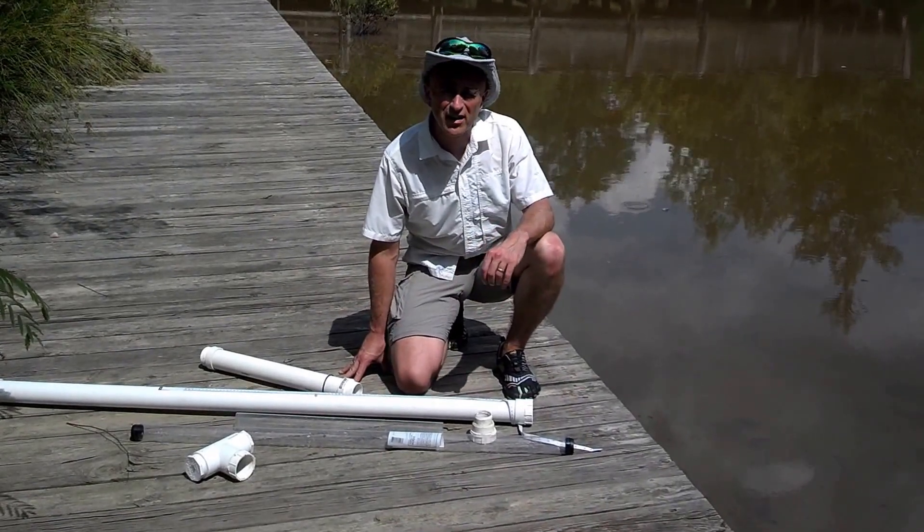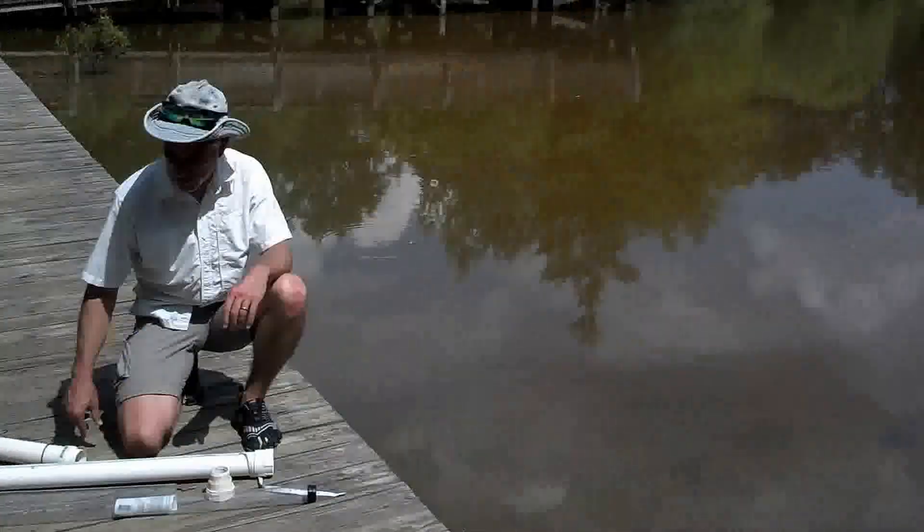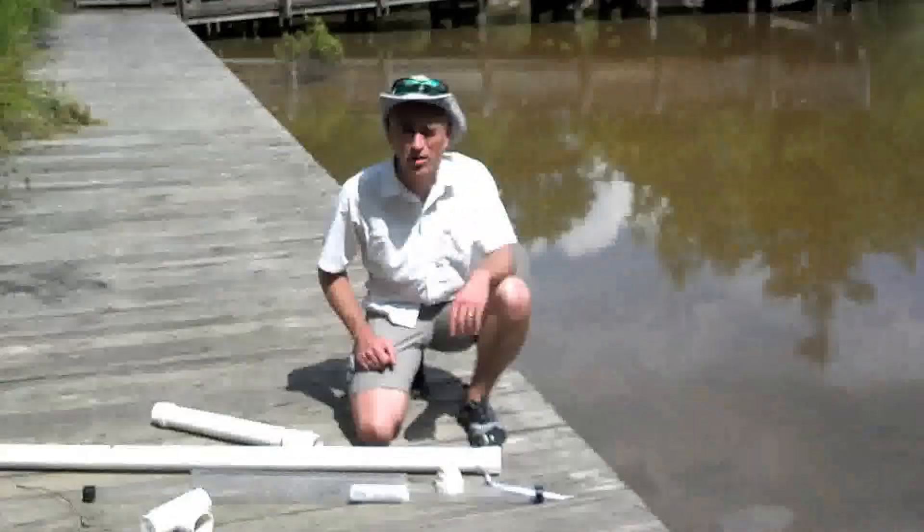Hi, in this short video I want to show you how to get lake sediment cores from a pond like this with a very inexpensive PVC sediment coring device.